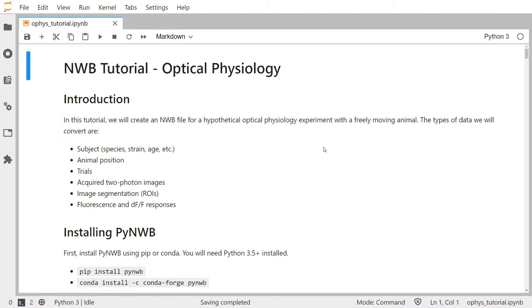In this file we will store information about the experimental subject such as the animal species, strain, and age, the animal's position over time, trial information, raw two-photon images, the results of image segmentation into ROIs, and the fluorescence or DF over F responses.